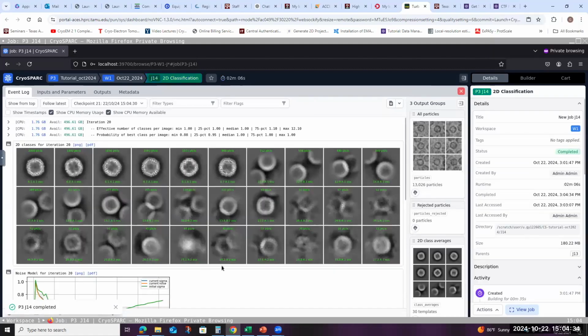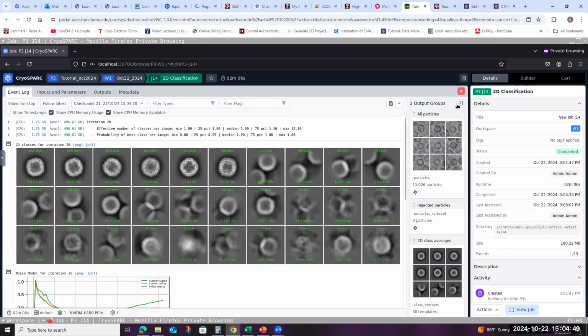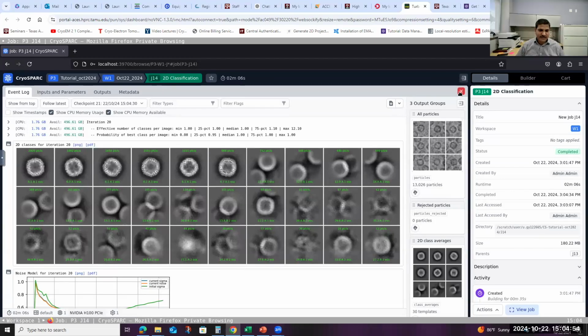Hey, Gaya, while this is running, let's take a 10-minute break, and we'll come back at 3:15. It'll take a little bit for that to run, right? Oh, it will not take long. It's already done. Okay. Well, let's take a 10-minute break. Or maybe we can start another job that takes like 5 to 10 minutes. Okay. And we take the break.